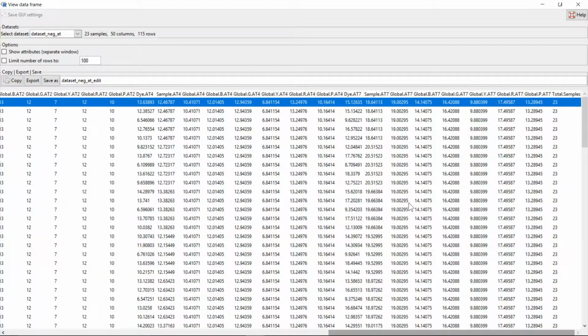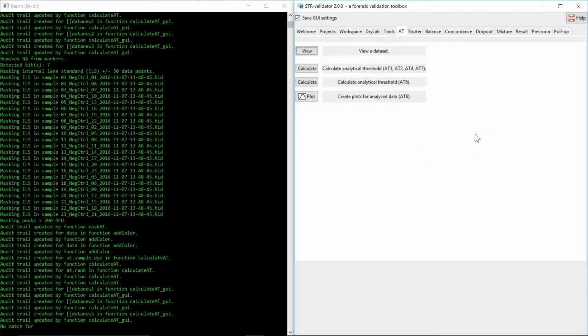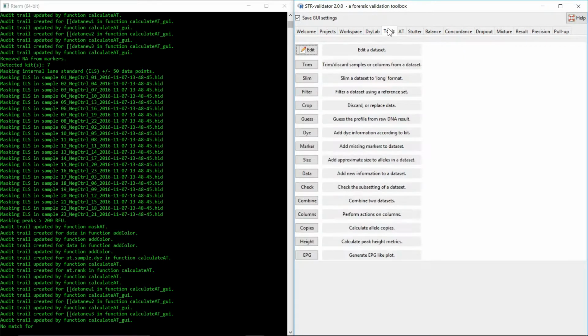Both method 1 and 4 assume a normal distribution of the noise data. However, method 7 uses logarithmic data. So which method should we choose? Well, we can check the assumptions if we first extract all the data used in analysis.